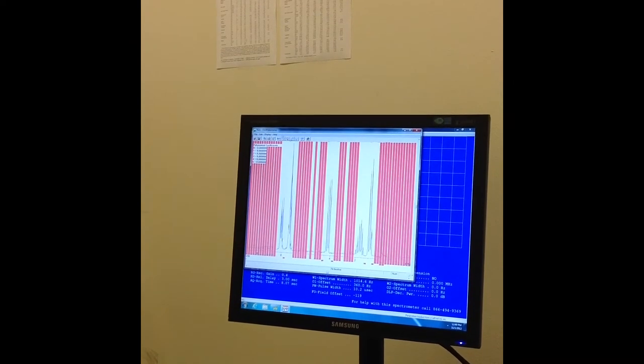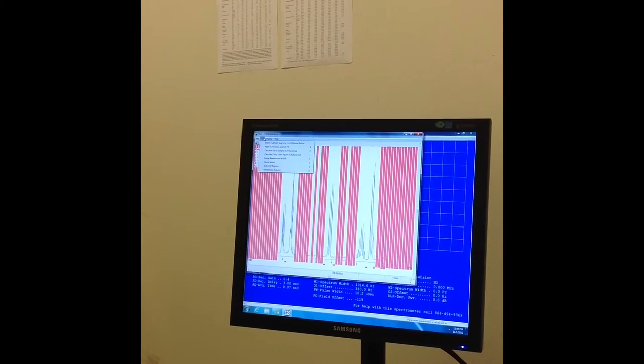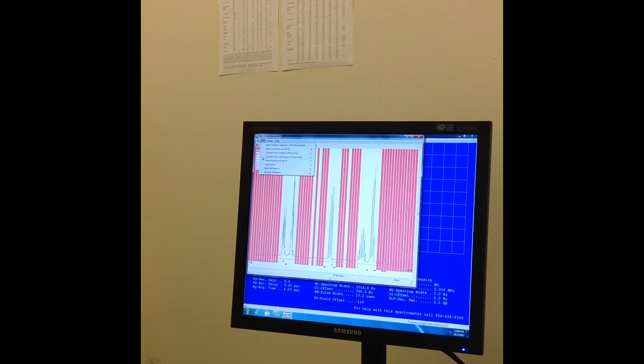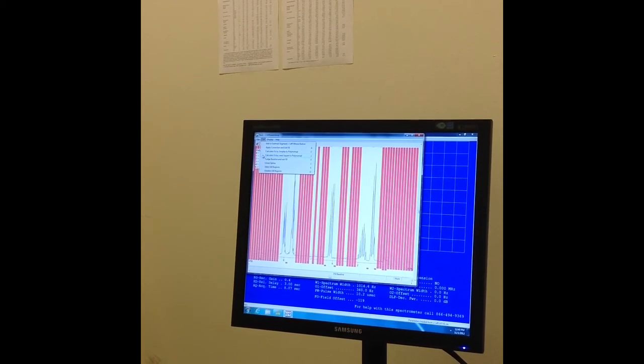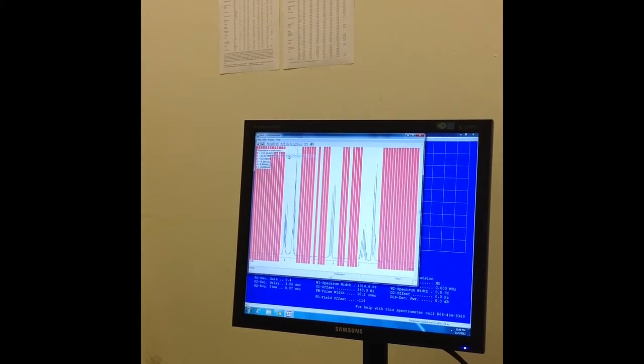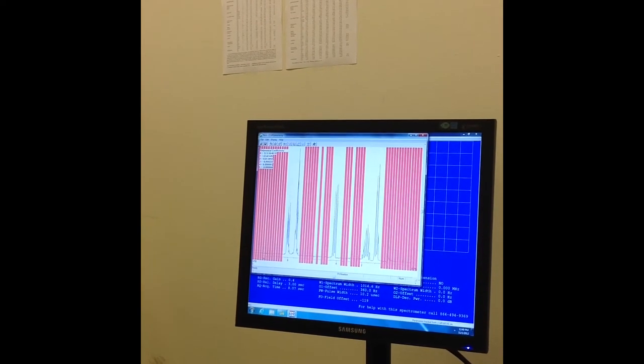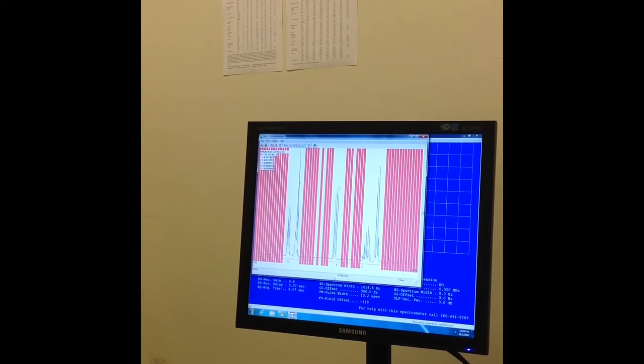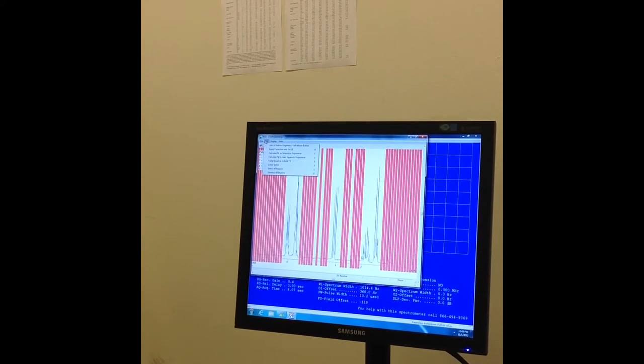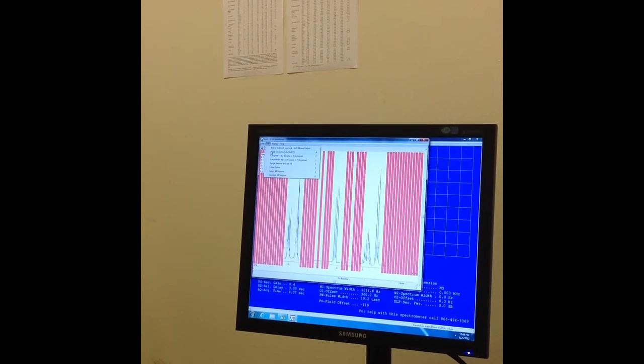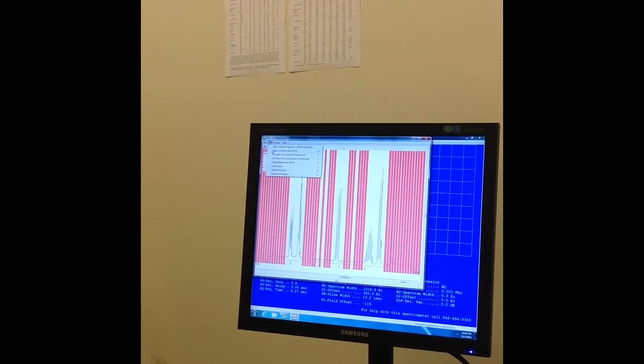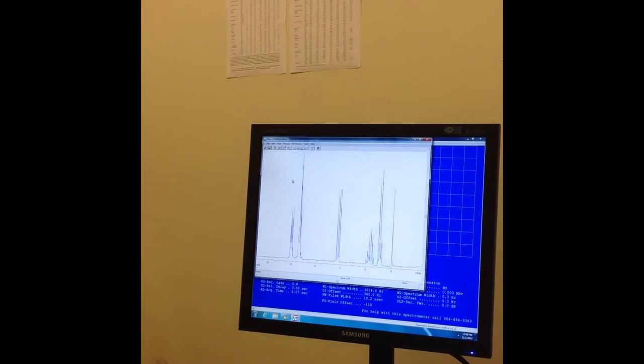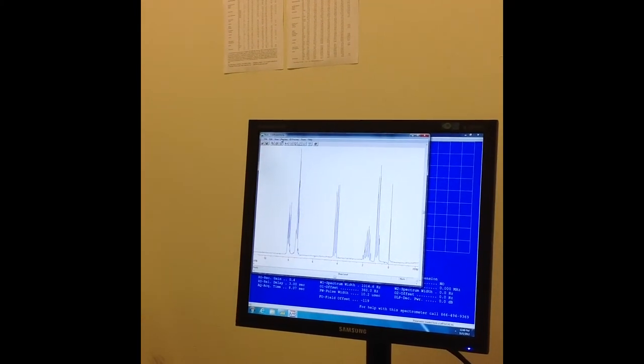Now I'm done with that, I'm going to go up to Edit, and I'm going to click on Calculate Fit by Least Square Polynomial, which is L. I'm going to click on that, and that will change your values for the polynomial coefficients. Then I'm going to click on Apply Correction and Exit FB. That gets you out of that Fit Baseline function.